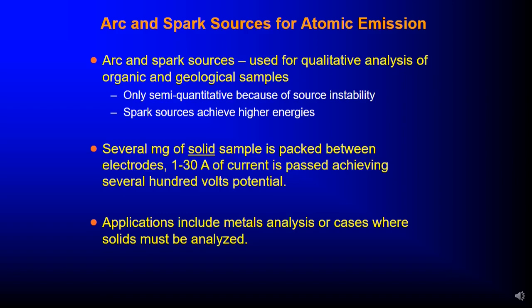Several milligrams of solid sample is packed between electrodes, 1 to 30 amperes of current is passed, achieving several hundred volts of potential. Applications include metal analysis or cases where solid must be analyzed.